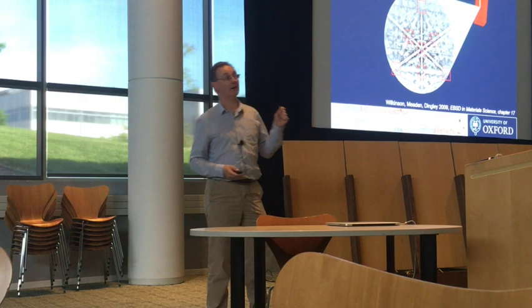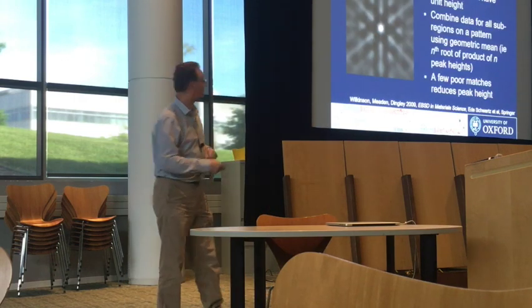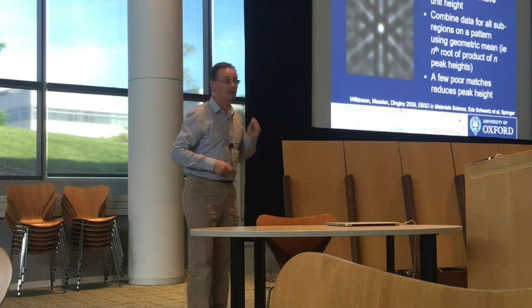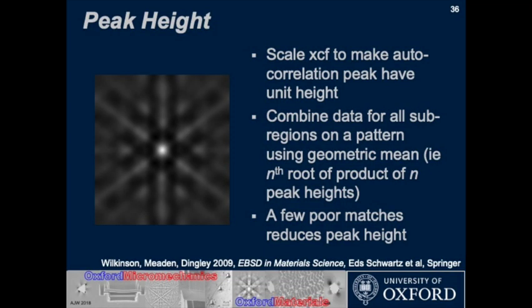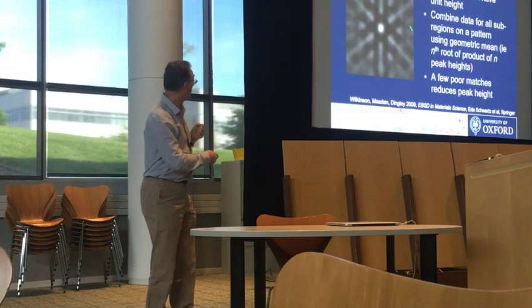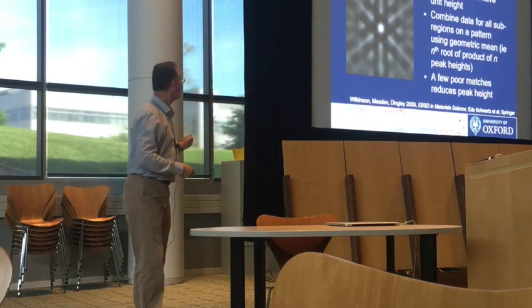So we want our mean angular error to be small. The other thing we can use is to go back to the cross-correlation that we have at the start and measure the height of that peak in there. Because if we normalise things properly, so that our cross-correlation goes from -1, where it's the same pattern but inverted contrast, all the way to +1, then the height of that peak tells us something about how good the match is. Okay?